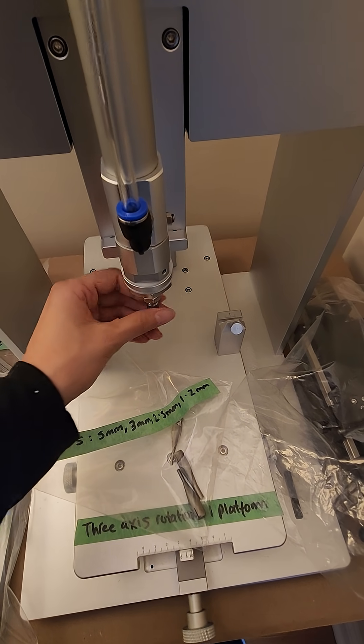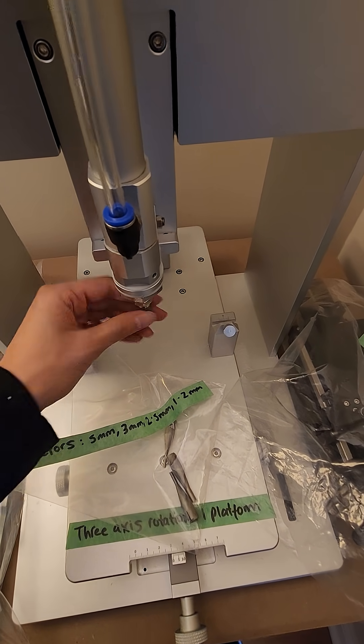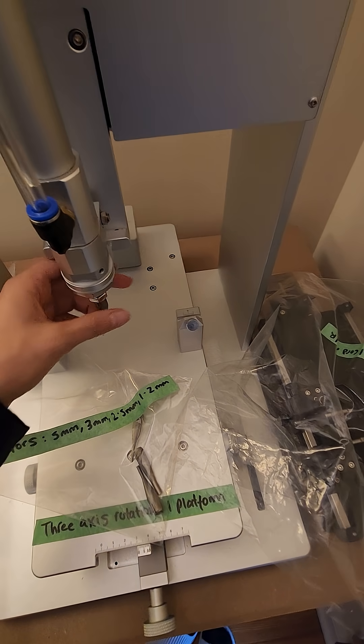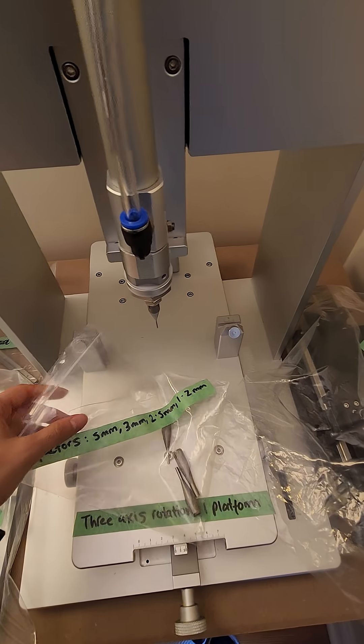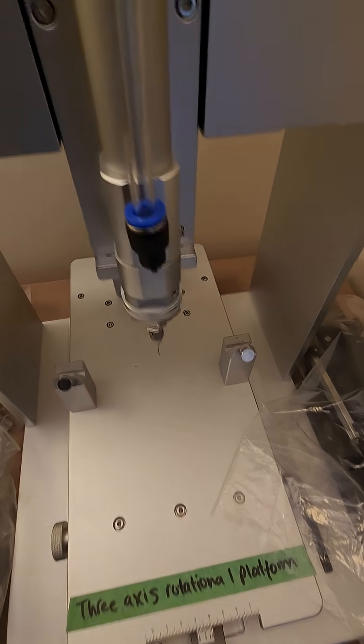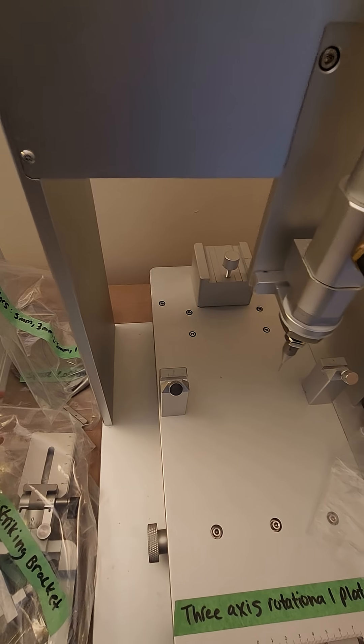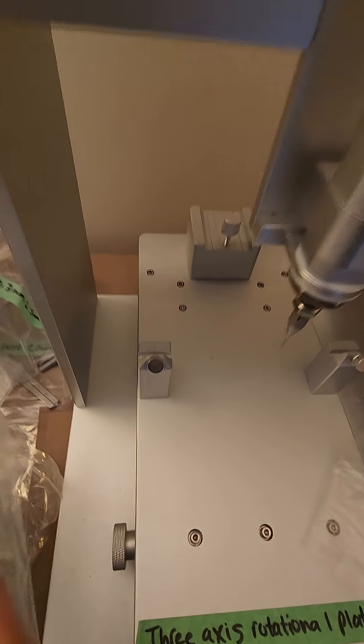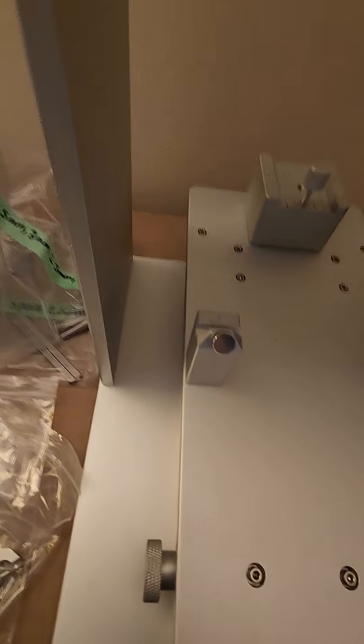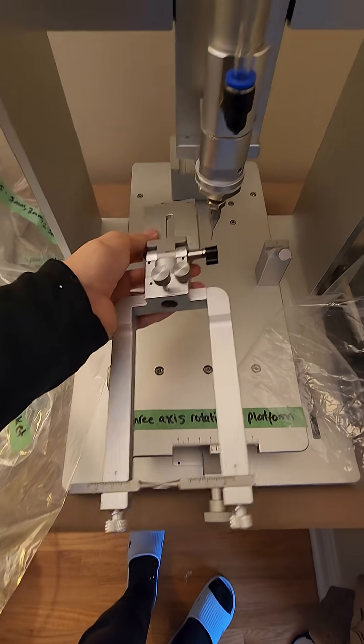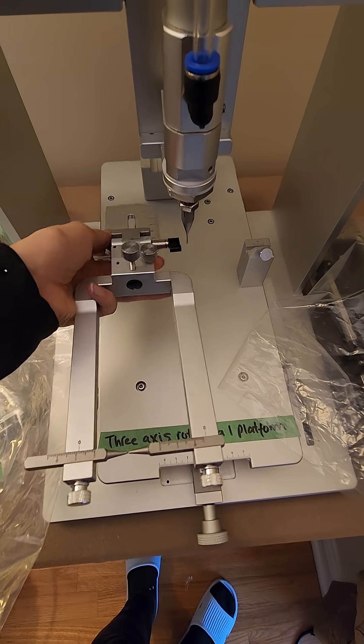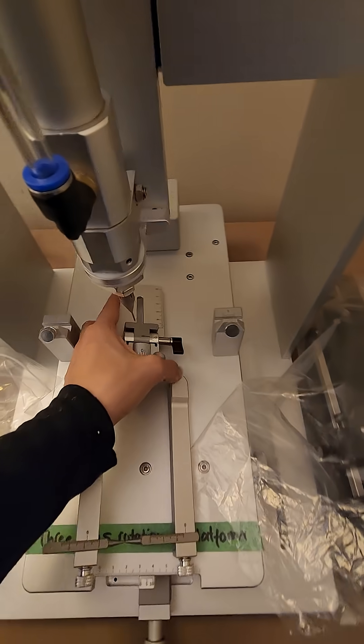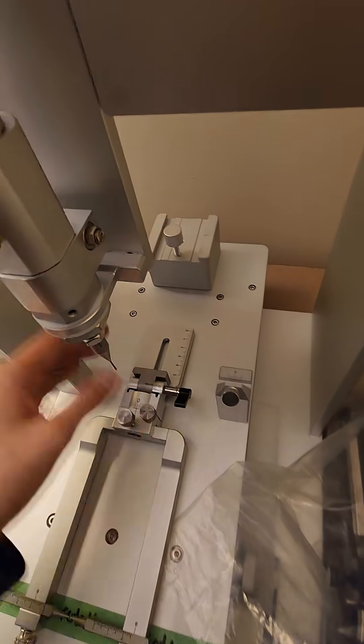To change the adapters at the back, it's very easy. This adapter you use with the rotational adapters.